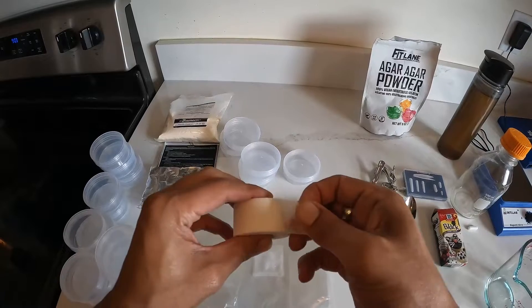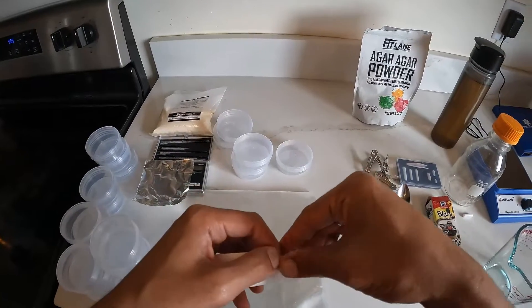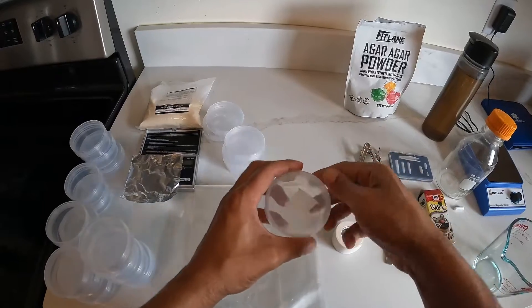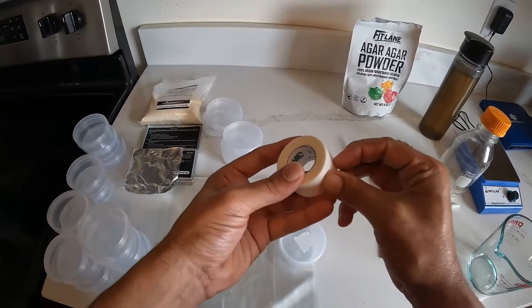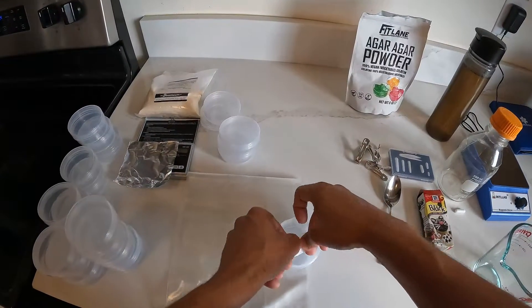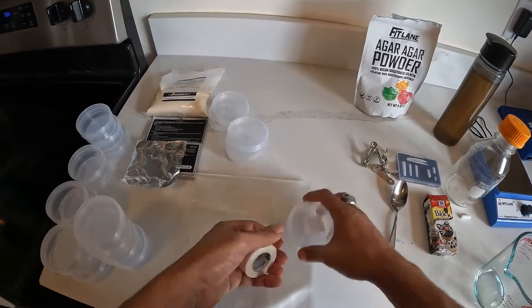Next, what we want to do is go ahead and take your micropore tape — this is our breathable tape — and we will go ahead and cover up that hole we made. I typically like to do a double layer, but it just depends on how clean your environment is and how much you're going to be moving them around.